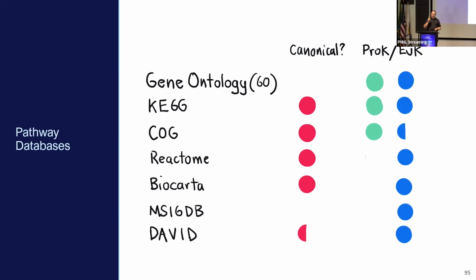And if you're looking at things like metagenomics, that can be difficult, right? You're looking at a lot of organisms that really haven't had laboratory studies done on them. There haven't been big annotation efforts. So a lot of times what you're looking at are computationally transferred annotations, which are reasonable, right? They're based on orthology and things like that. But you're not going to have a specialized database for your weird bug that you just isolated.